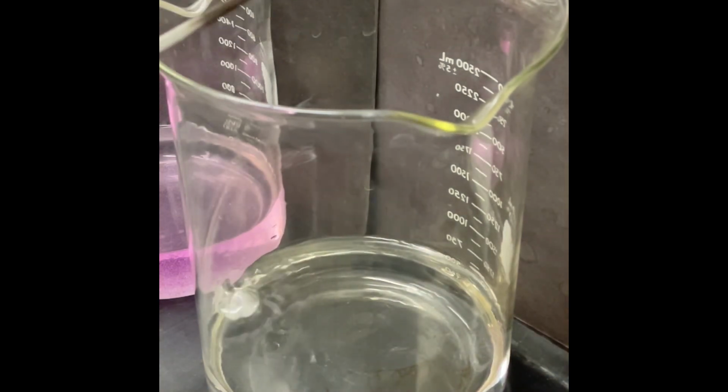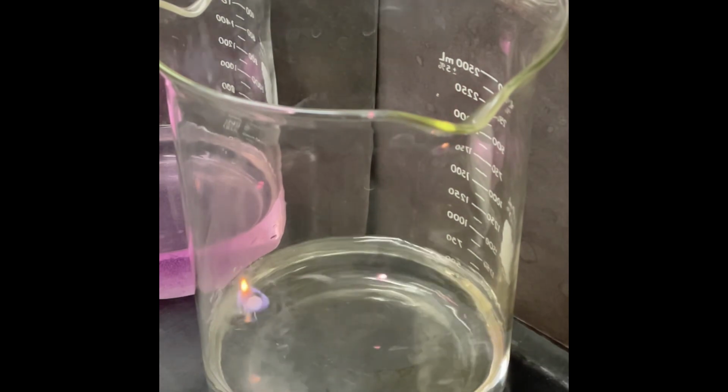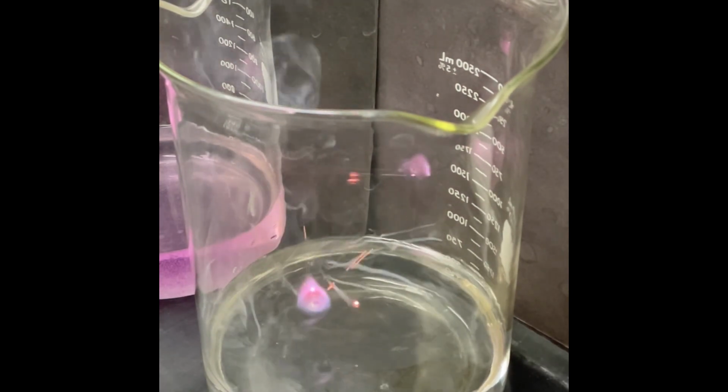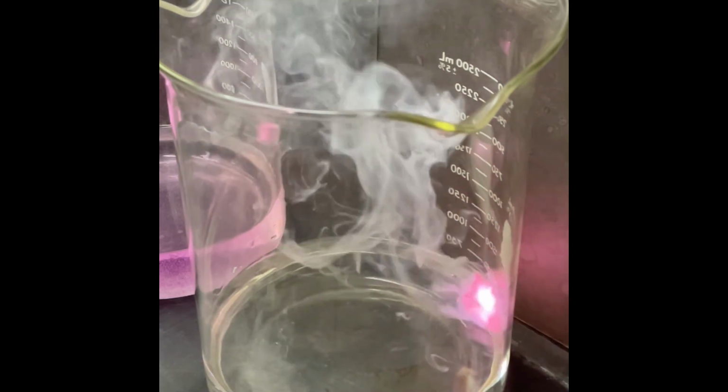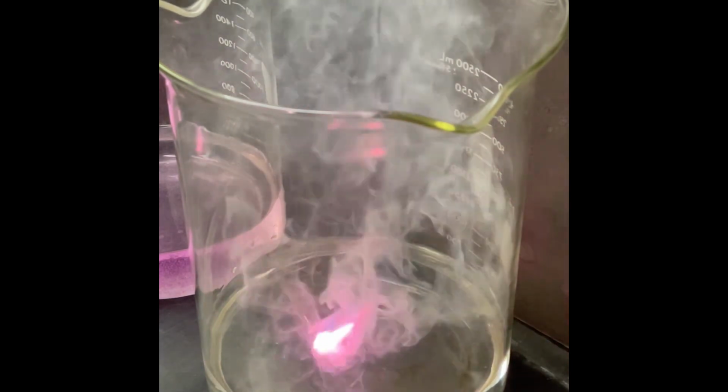If we watch this in slow motion, we can see just how hot the potassium gets. It starts breaking up and spitting off little chunks. As it approaches the left edge of the beaker, there's enough excess hydrogen that it spontaneously ignites.